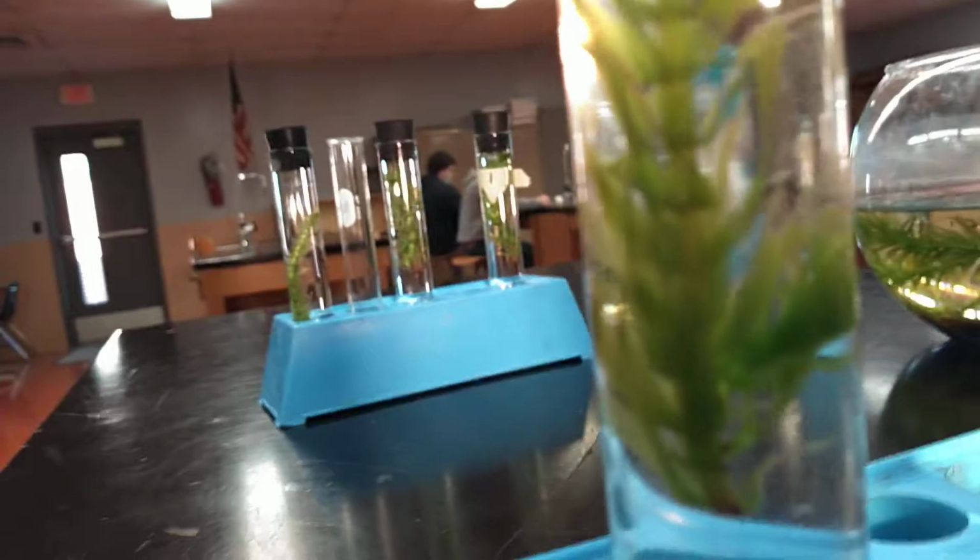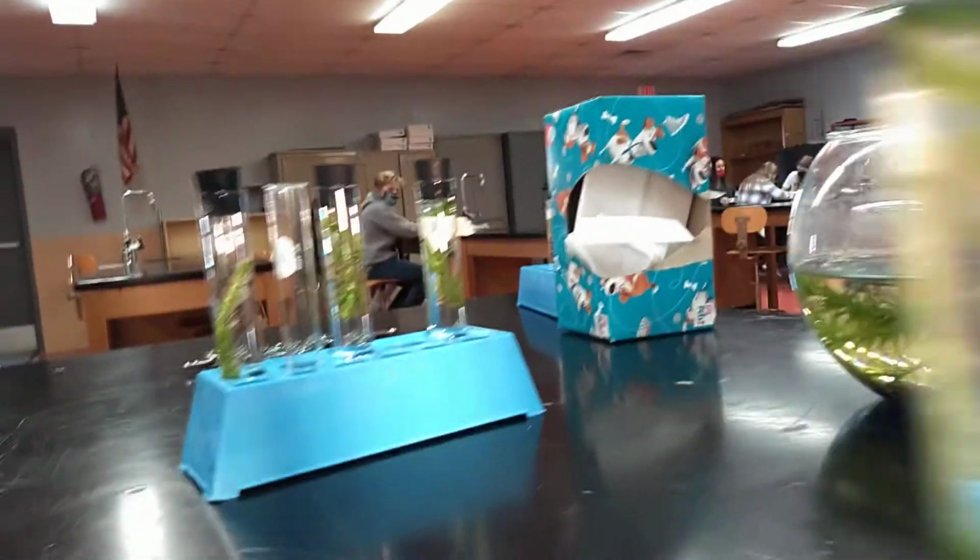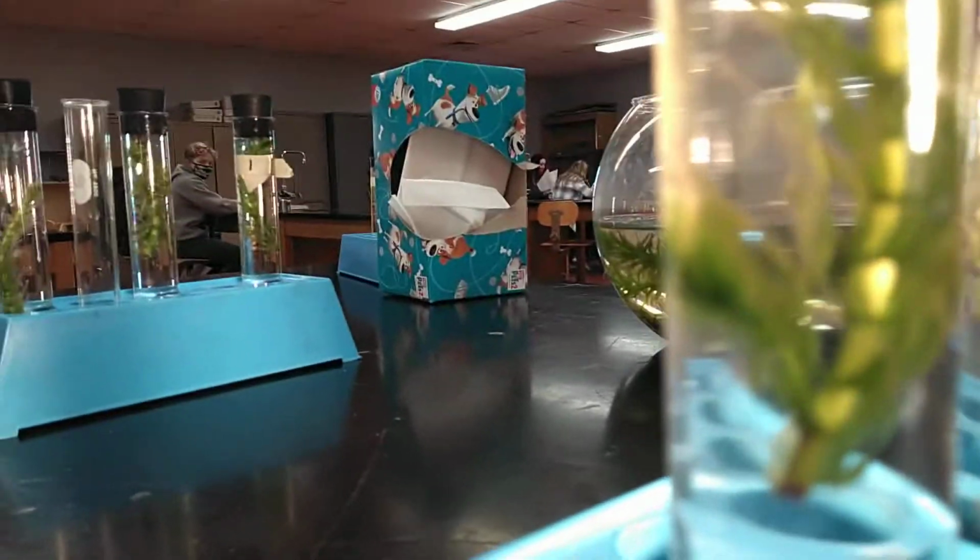I had a student make a really cool observation in this one right here. I don't know if I'm able to get it. Look all the way at the top right here. Yeah, there we go. There's a little snail in there. We've got a little animal in this one. So it's actually doing cellular respiration balanced by photosynthesis.